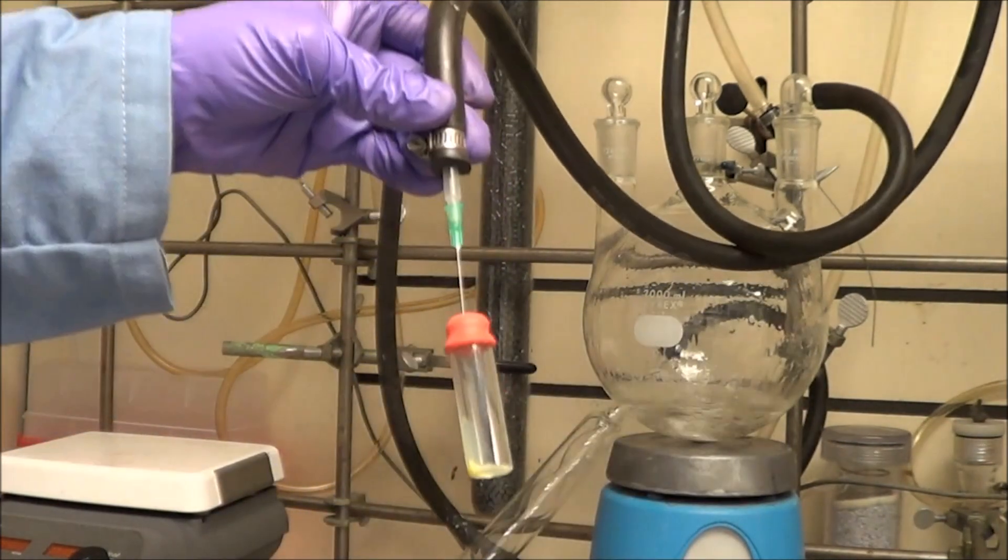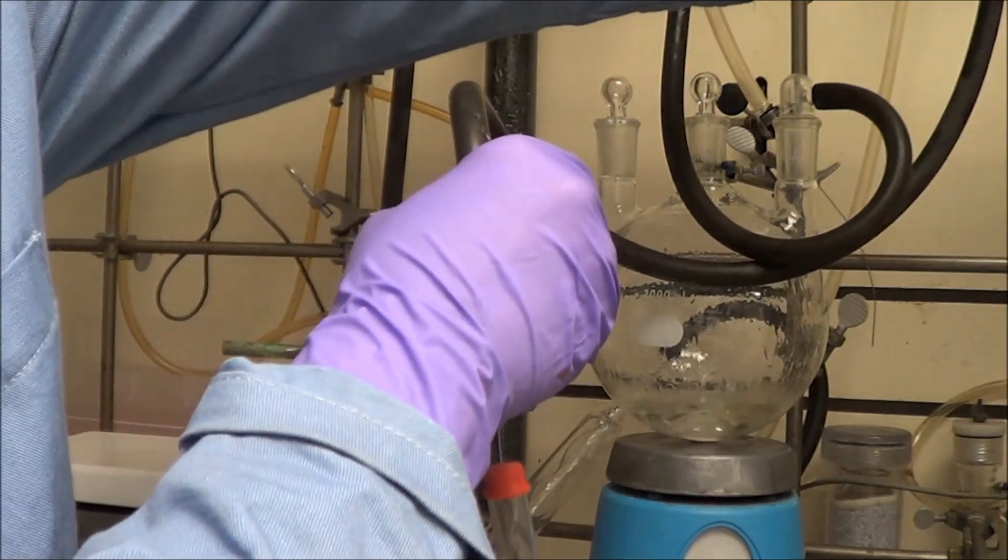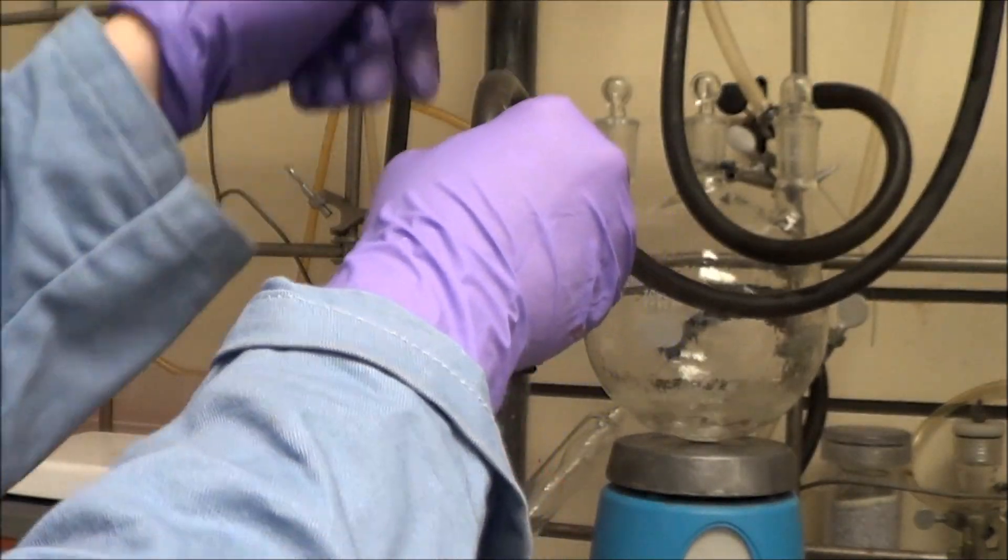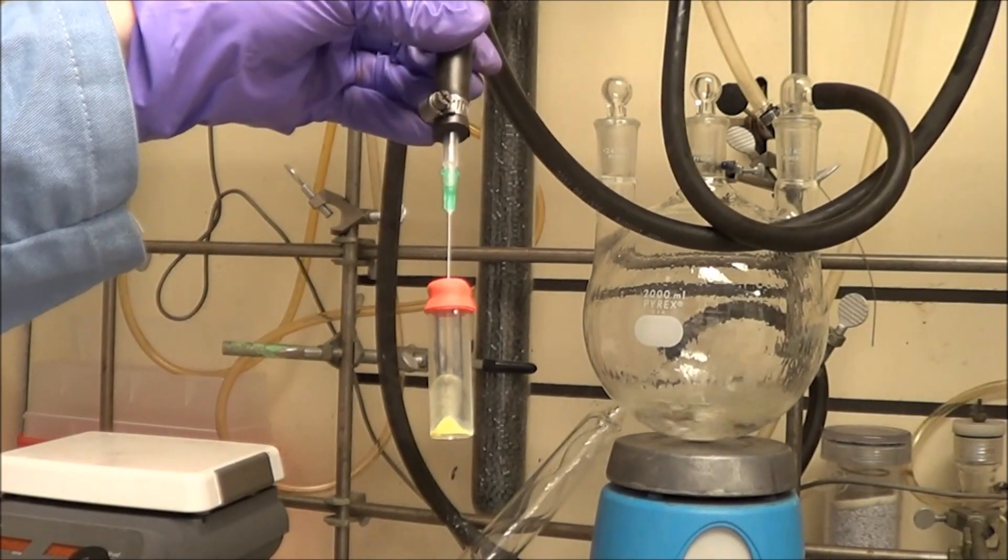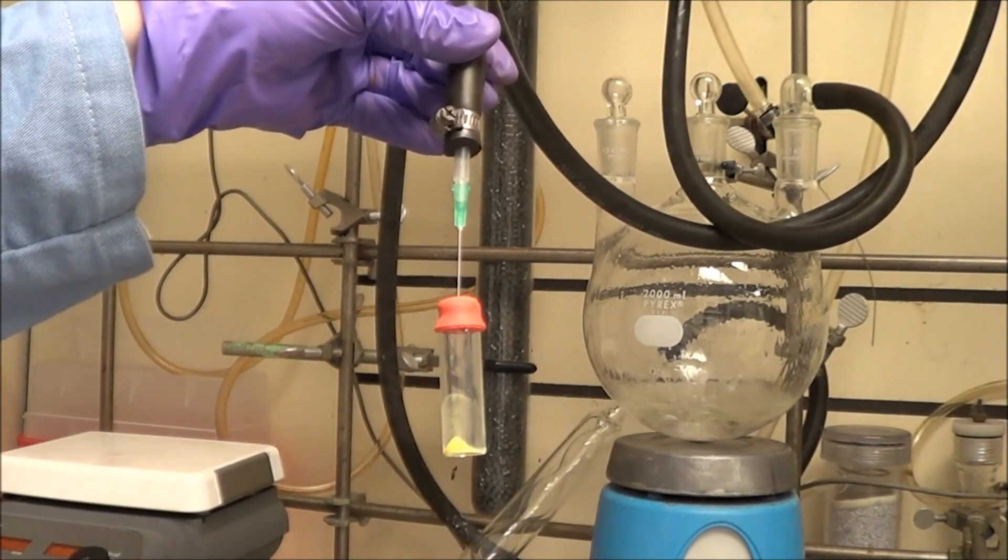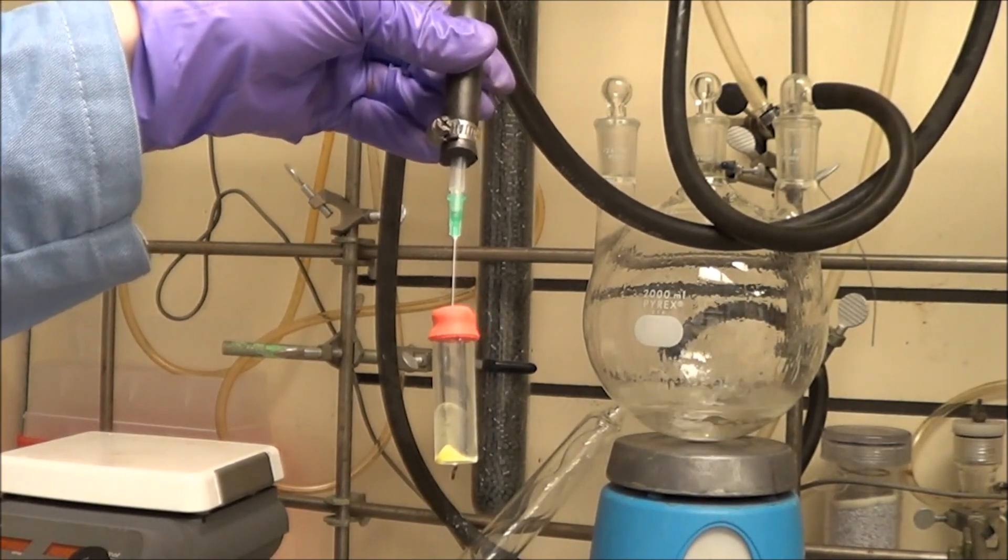Here we are attaching it to the Schlenk line, and one way that I know that it's dry with this initial drying is that I have a pressure gauge attached to my Schlenk line. Once the pressure has gone down to the equilibrium, I know it's done. I try not to overly dry the sample because that seems to cause less dots to go into water later on.